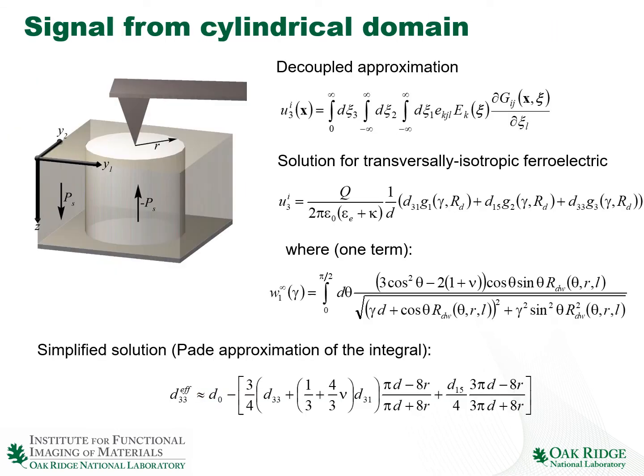We can also use the same approach to analyze the signal from the cylindrical domains, and this is really important for analysis of the PFM spectroscopy experiment when we use the PFM tip to switch polarization and measure the signal in terms of the applied bias.